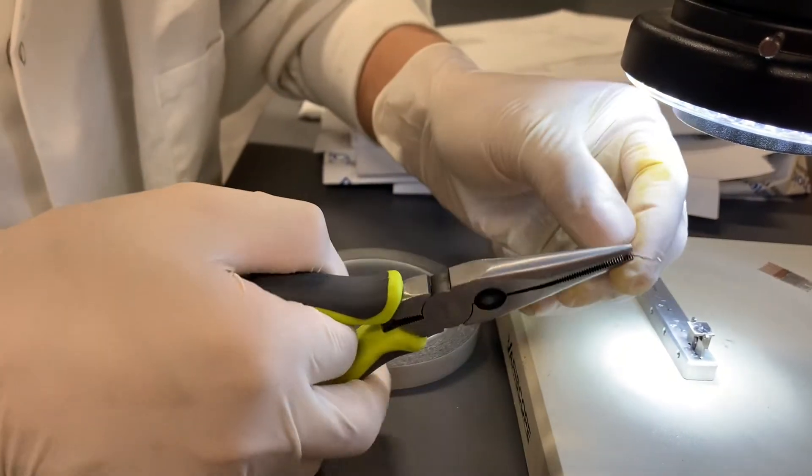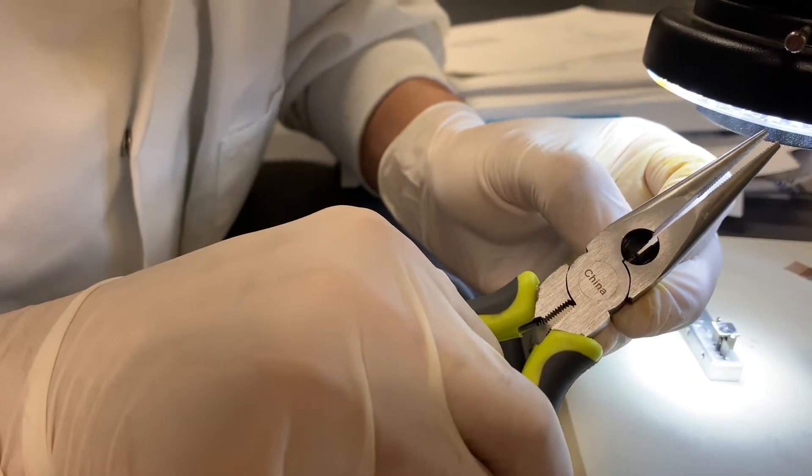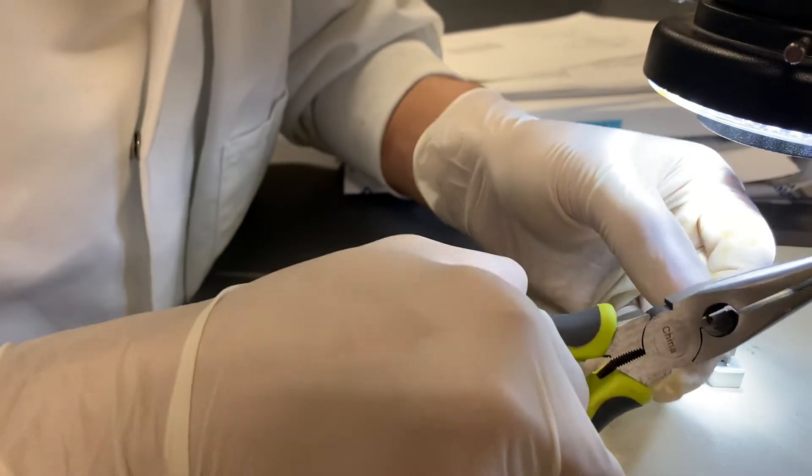Cut the head of the pin. Be careful, don't scratch the surface.